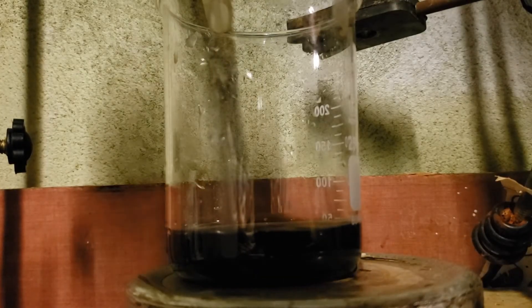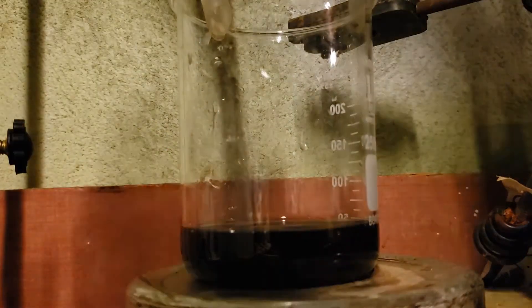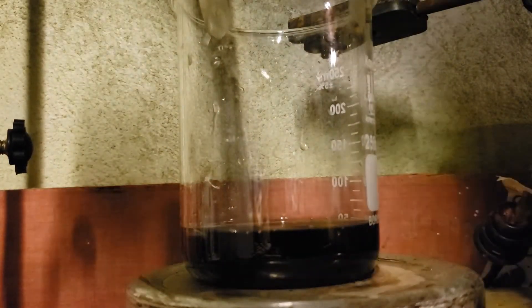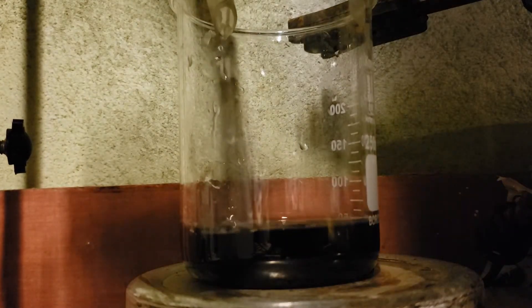After the two hour reflux was up, the reaction mixture was chilled in an ice bath to slightly below room temperature, then transferred to a larger beaker with the aid of a little water. 10% sodium hydroxide solution prepared previously was then titrated in.